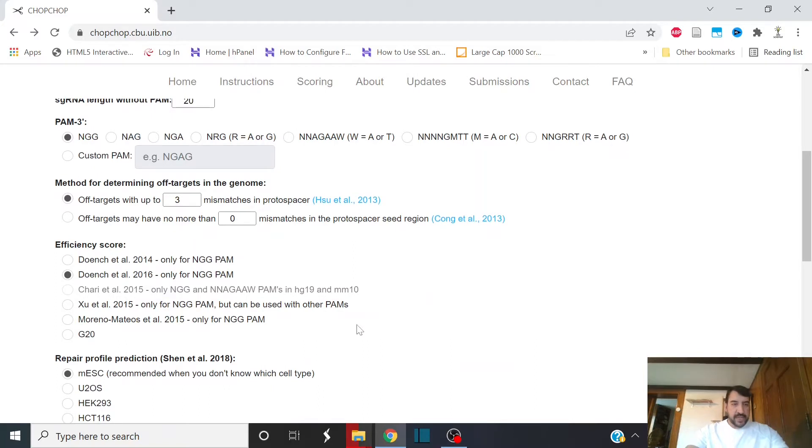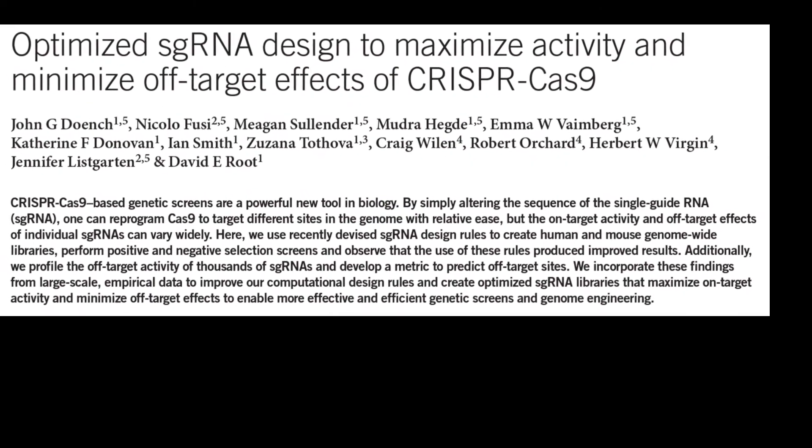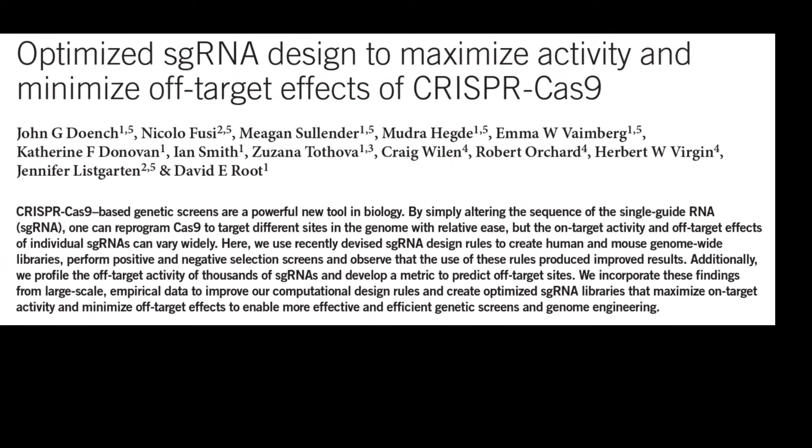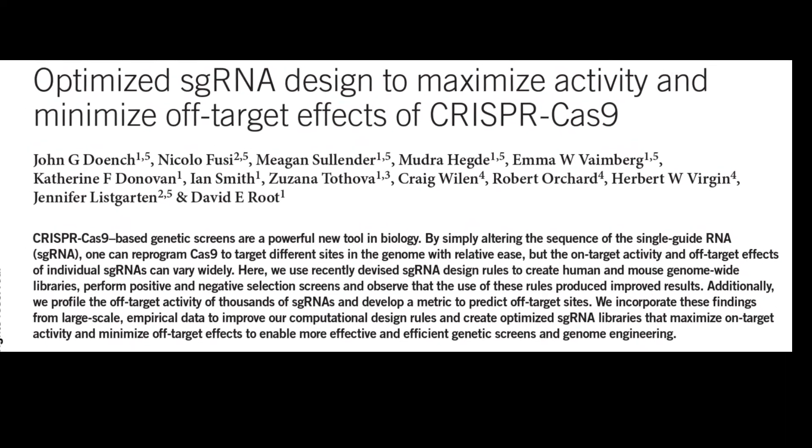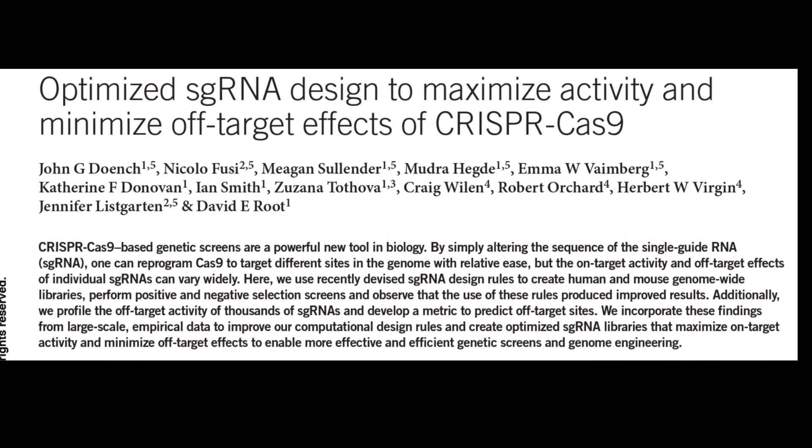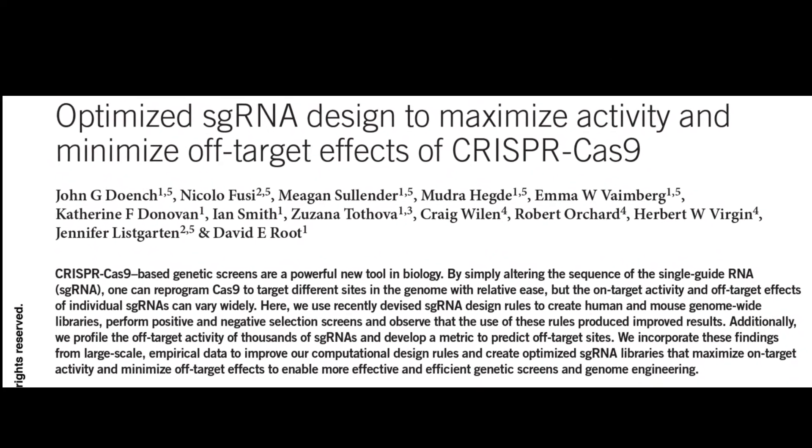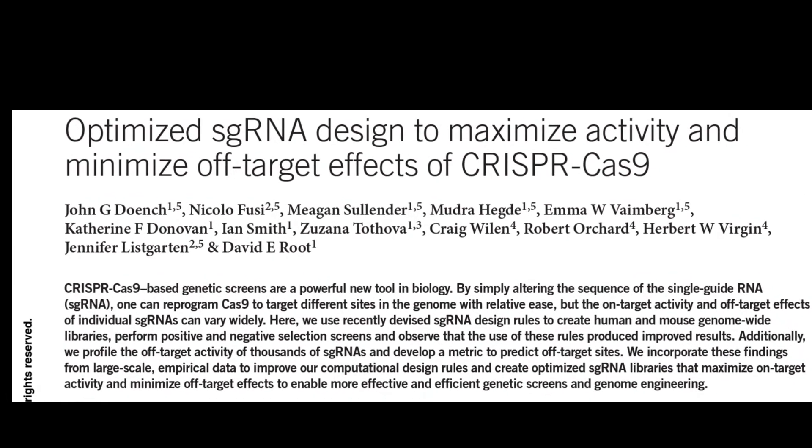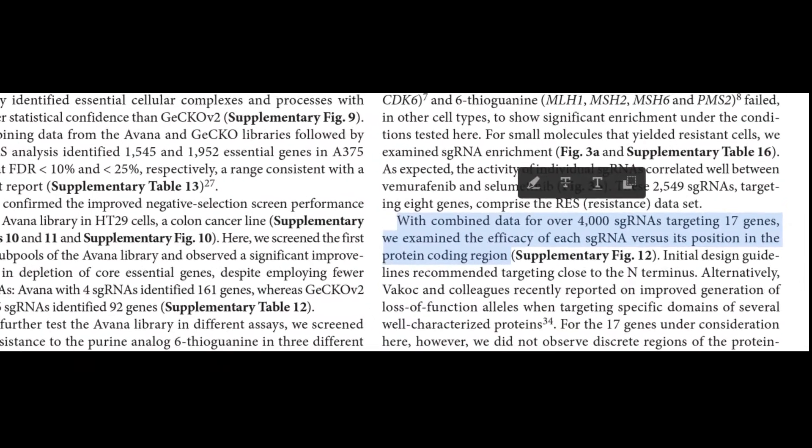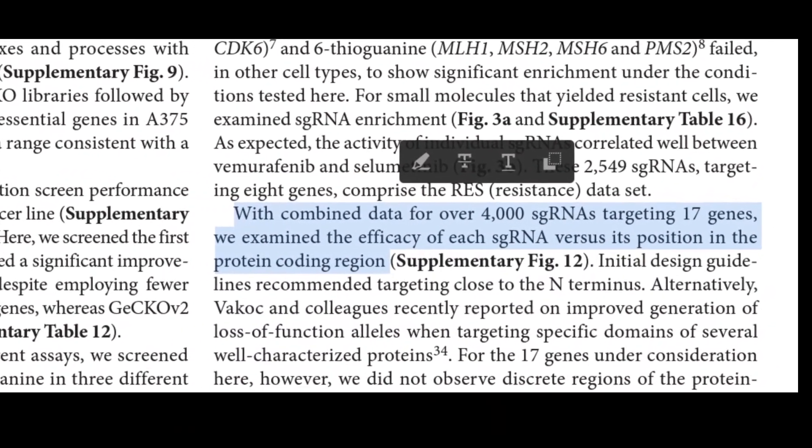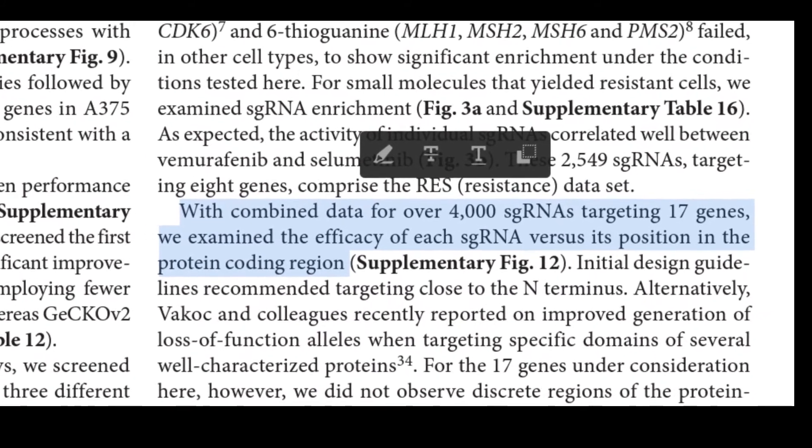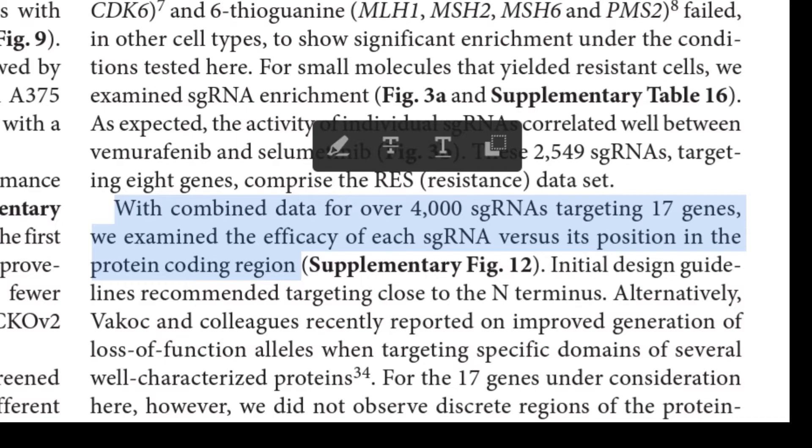And importantly, by default, the efficiency of the cuts are calculated by the Donch algorithm published in 2016. We're going to want to have that checked. Donch and colleagues came up with a computer algorithm that predicts how likely a gRNA is to cut its target site, so how efficient it will be at cutting its target site. They used data from over 4,000 guide RNAs to come up with this algorithm. It basically looks at the target site along with the bases around the target site to figure out protospacers that are very likely to be cut.